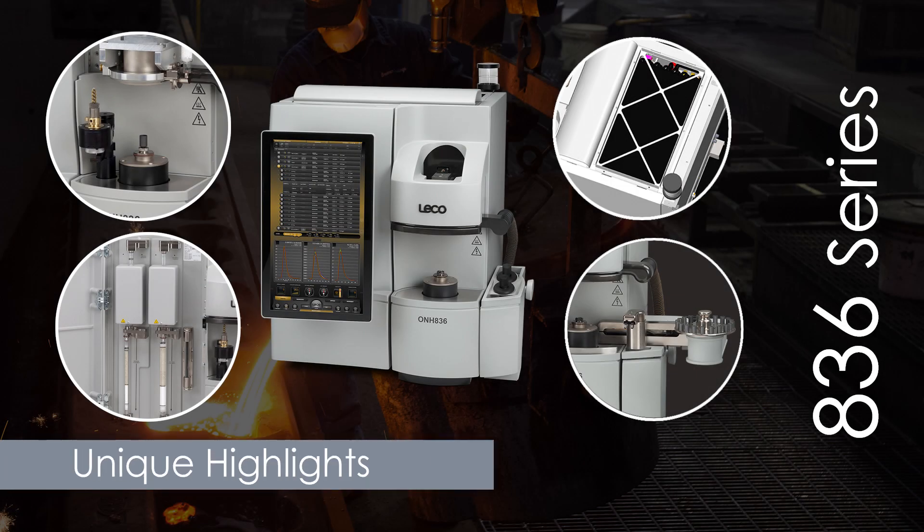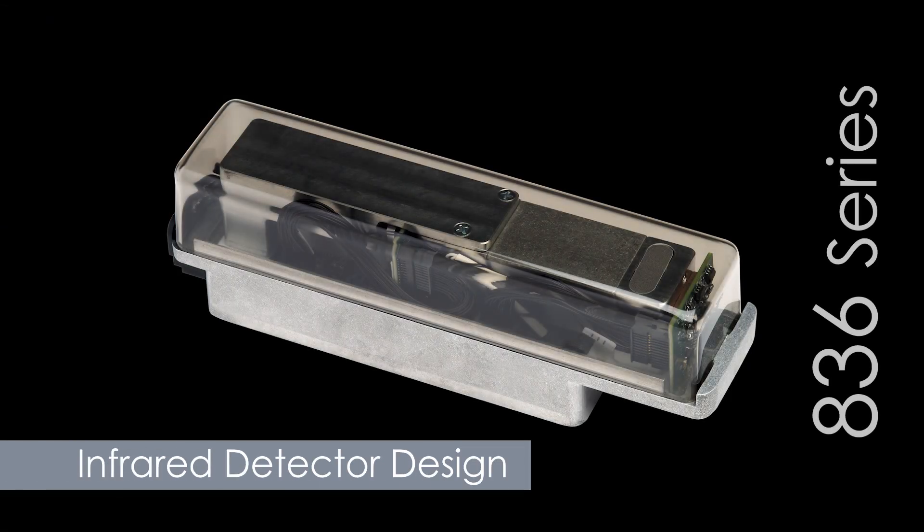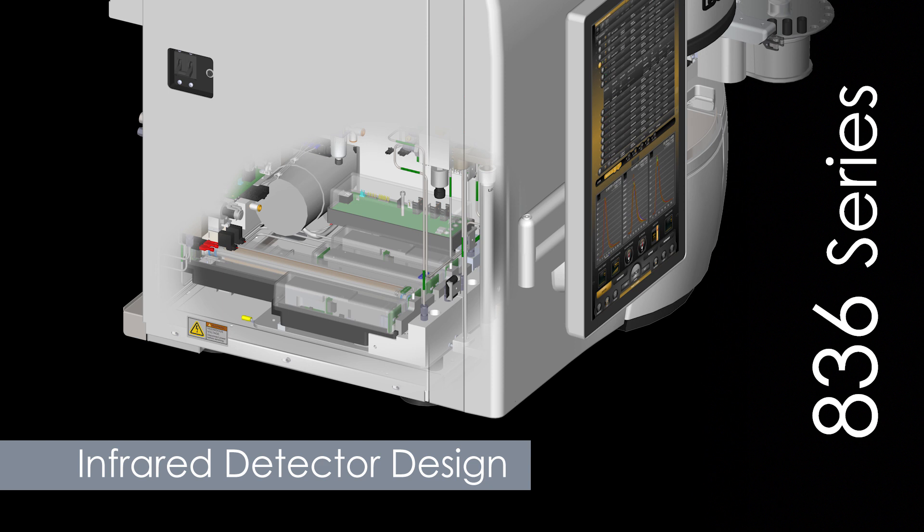Now let's look at some of this instrument's other unique highlights, all coming together to provide dependable results. A novel electrode design increases furnace heat transfer efficiency for greater system stability. The 836 series features an improved infrared detector design with thermostatic construction, increasing protection from ambient temperature fluctuations. Optimized emitter control and detection circuitry improves the IR cell lifetime and long-term stability, resulting in superior accuracy and precision.